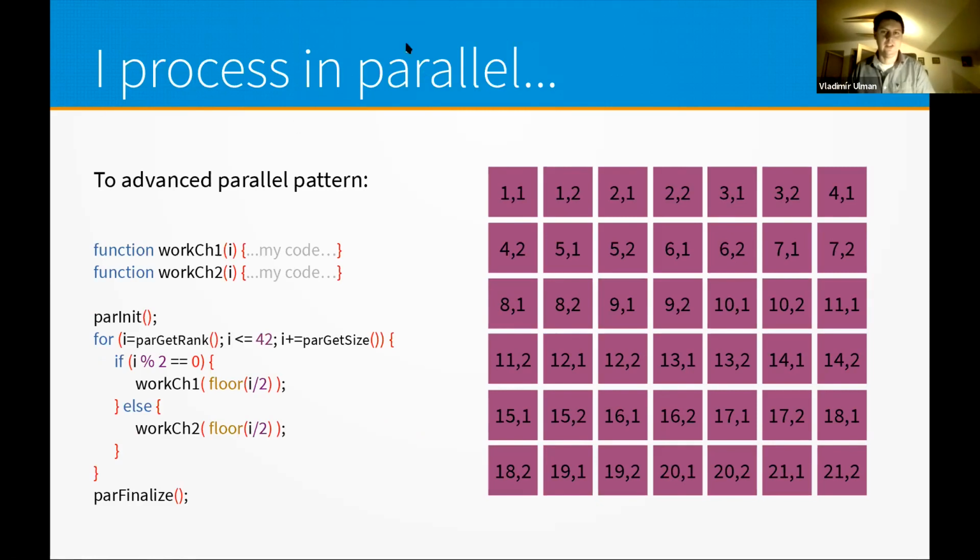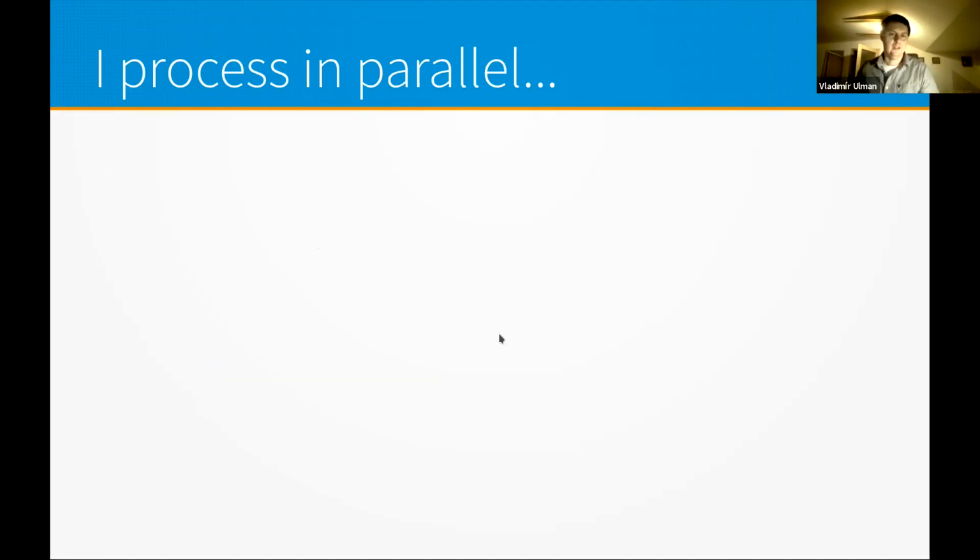Here, this is just homework. You can reach this PDF on the Slack. You can inspect this. It's only an example that the mapping of your problem into this kind of addressing scheme can get arbitrarily complicated. We will see in the real example that it will get even a little bit worse. We would actually need extra helper functions to figure out how to address the individual tiles, how to cherry-pick the relevant portions of the data. And it really depends. Here the example is showing 21 images with 2 channels, but I will leave it as homework. I'm sorry for now.